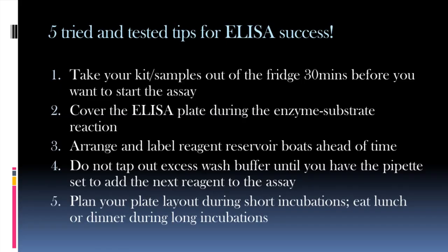The very last step is to plan your plate layout during your incubations. So again, the last step in your ELISA is to read your plate on a plate reader or spectrophotometer, and you typically will have to outline the design of your plate. So specify what is present in each well, specify what kind of regression you're using to analyze the concentration of your sample.